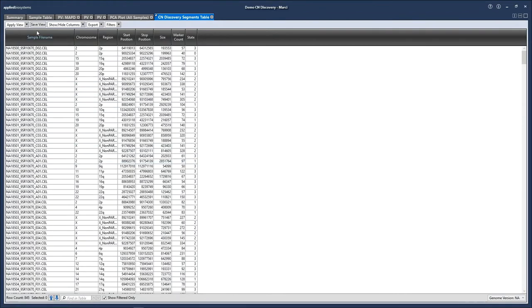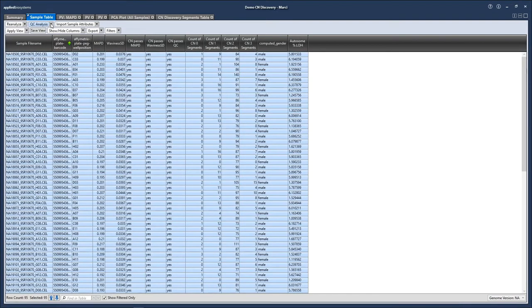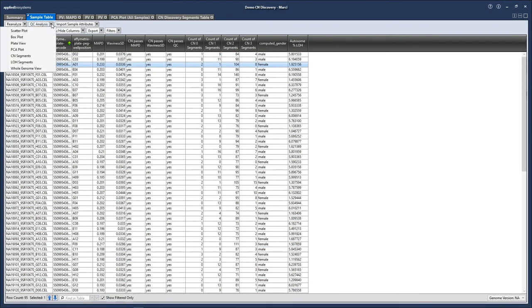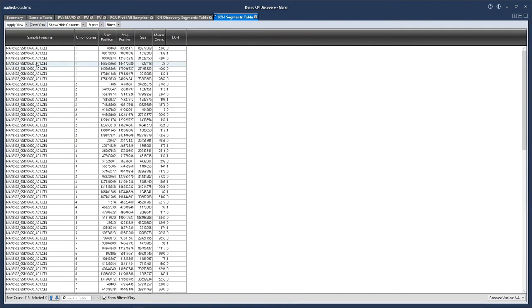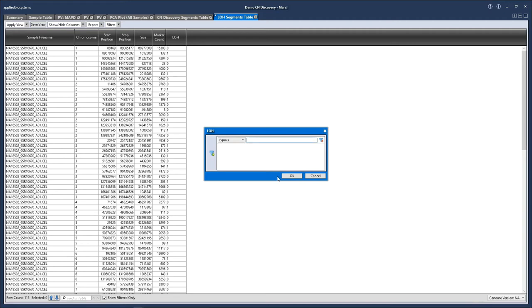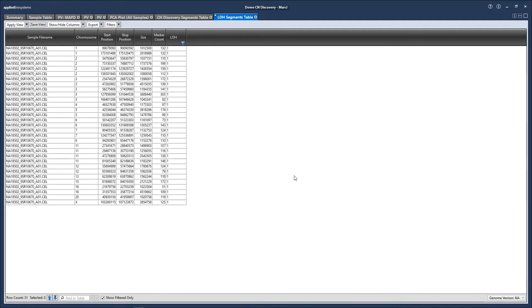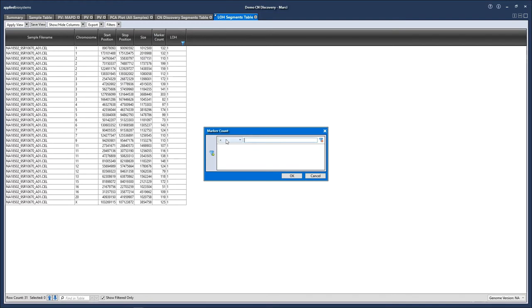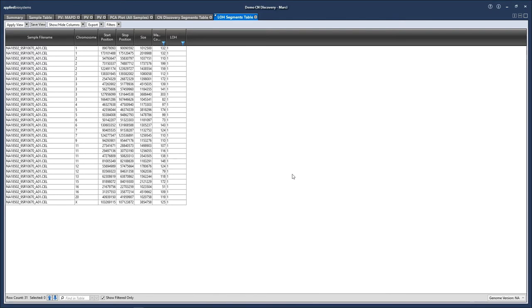Next, for loss of heterozygosity, we can pull up the LOH table. Let's do this for just one sample. This table will show all regions that have been evaluated for LOH, and a flag of 1 in the LOH column indicates the presence of LOH. Let's filter this column by equals 1. We also recommend setting a marker count filter of at least 25 markers. So I'll right click on this column, click filter, and set greater than or equal to 25. Now our table contains regions identified as having loss of heterozygosity across at least 25 markers, with the sizes and positions given in the other columns.